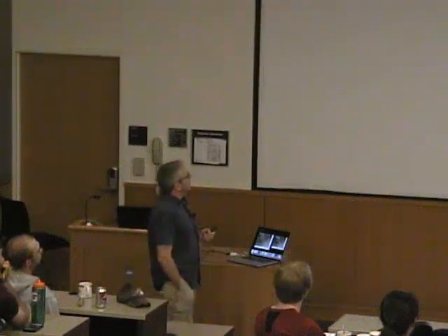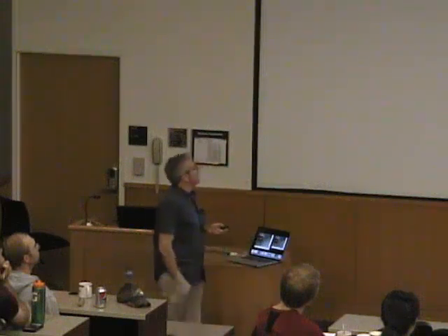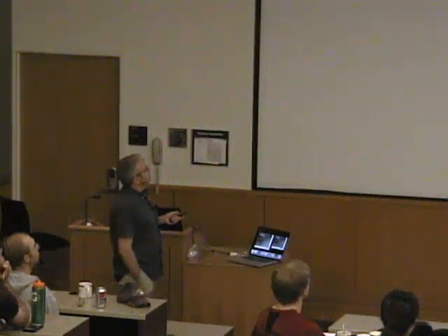I just show you one, not because it's the best or the fanciest, but because it's probably the most nicely localized. This is the city of Grenoble in France, and I guess you all can see the synchrotron. It's actually here, and it's actually very scenic. So we hardly ever go there because we have a closer one, but it's probably the one that's most nicely located. And it's also one of the larger ones.